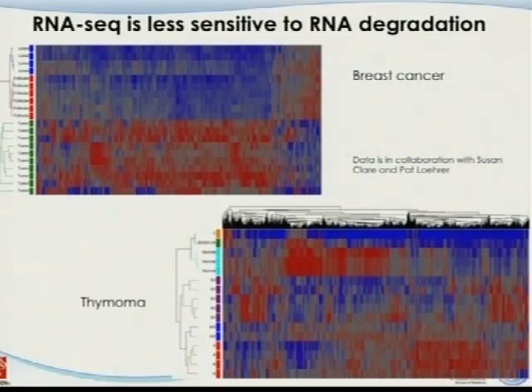And for the thymus cancer, this becomes even more striking. Most of the pathology information, the different subtypes of those cancers, was done by Sunil, by the way, who is one of our best pathologists. But we really don't know whether it's correct or not. After we did the RNA sequencing experiment and clustered the data together, we saw that Sunil did a pretty good job, right?